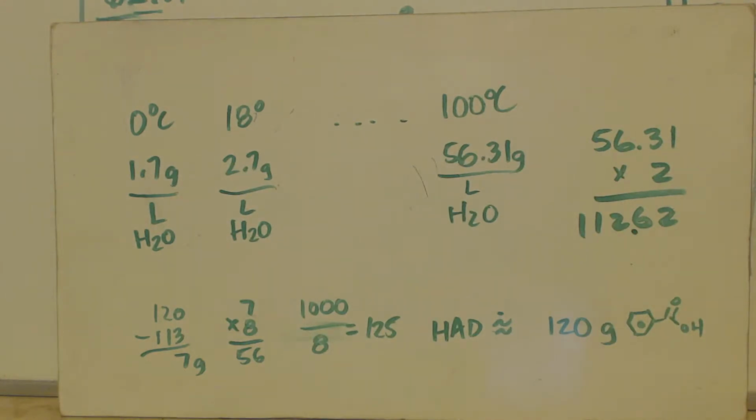Why I got such a bad yield? 75% is terrible. Maybe that's some sodium benzoate. Benzoate is not as pure as I think it is. Although I thought it would be like 95% pure or something like that at least. Maybe it's less pure, or maybe I'm just doing something wrong.